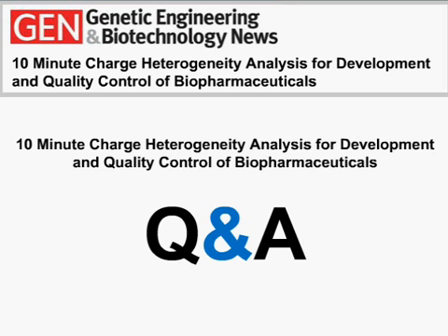If you have the same concentration of a compound with the same molar absorptivity, the concentration per peak would be, say, twice as much if you only had 2 peaks as opposed to 4 peaks, if all peaks were equal in area. Typically I start off at 200 micrograms per mL of a monoclonal antibody. You can go down as far as 50 micrograms per mL and still get relatively good detection if the compound has a low enough charge heterogeneity.